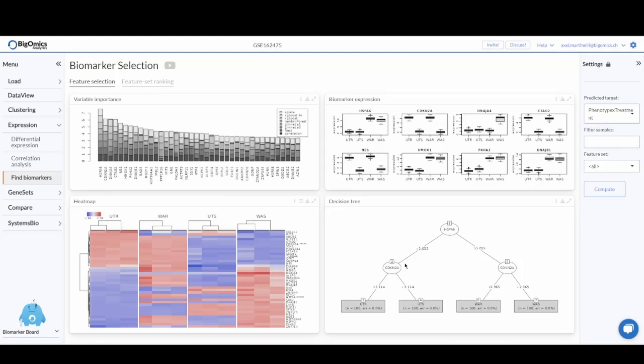The biomarker selection module in the Omics Playground platform is used for discovering biomarkers based on protein or gene expression levels.